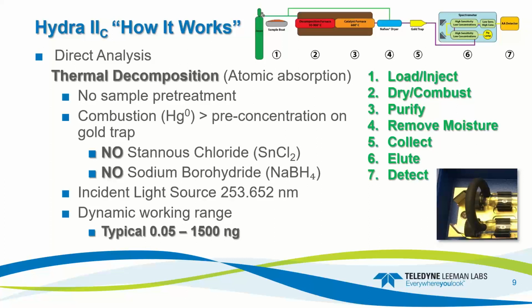So let's dive into the theory of operation. How does the Hydra IIC work? It's seven simple steps. We have the load and inject, then we dry and combust, purify, remove moisture, collect, elute, and detect.